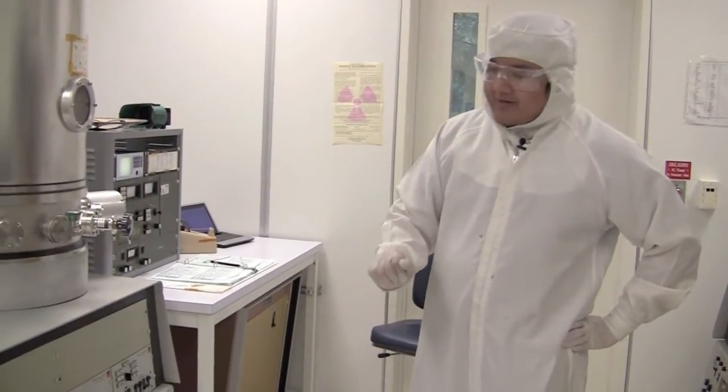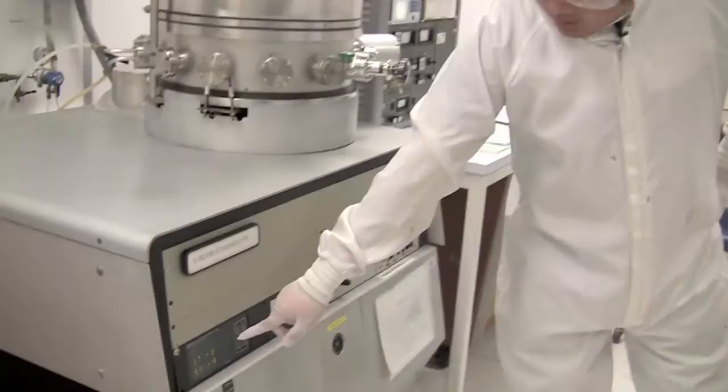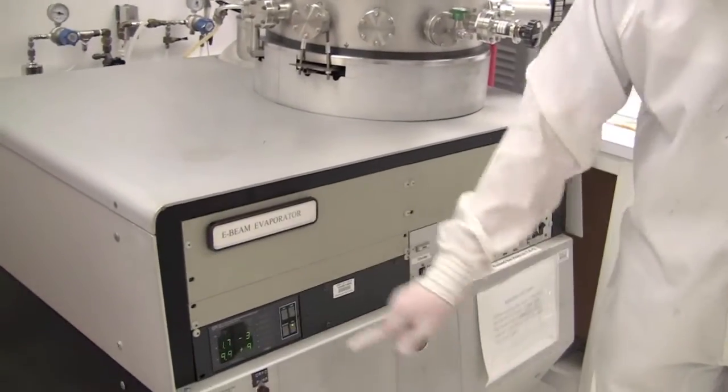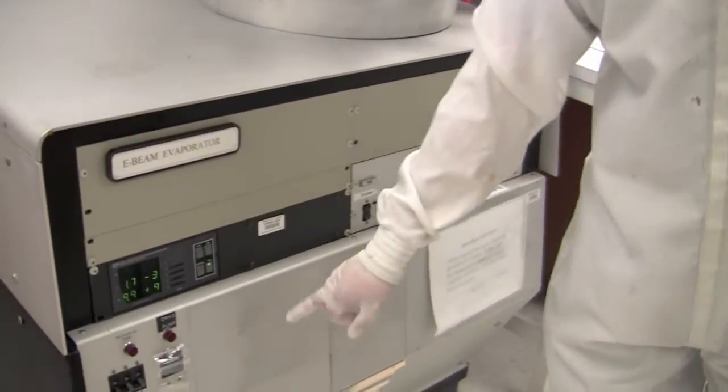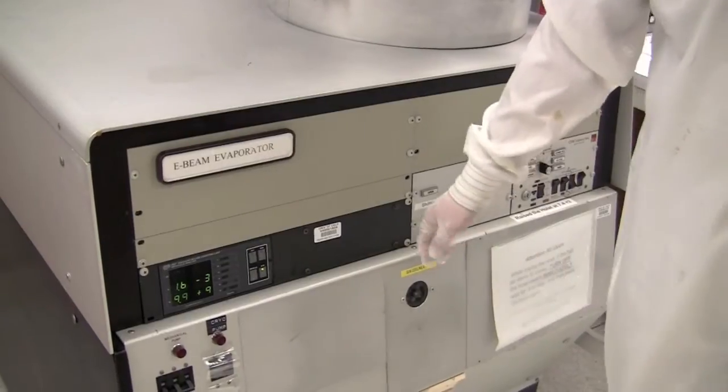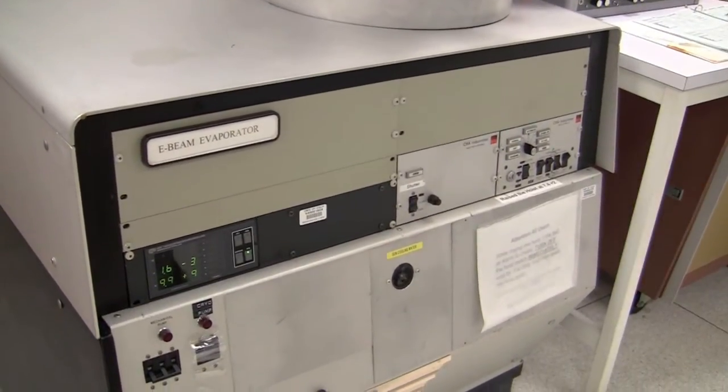So we're going to wait till the high vac goes in the negative 4 range and when it goes in the negative 4 range we're going to turn the ion gauge on. So we'll just wait for the high vac to pump down.